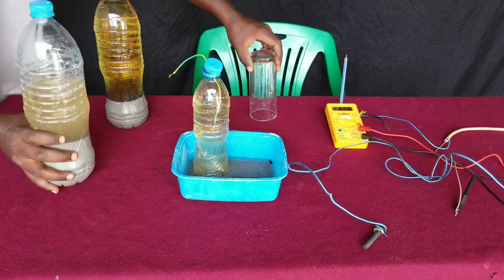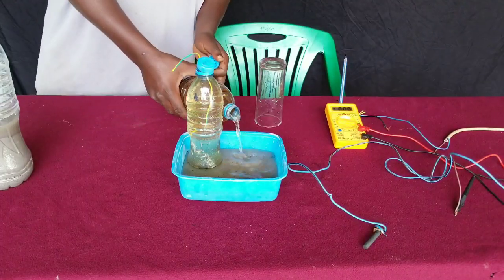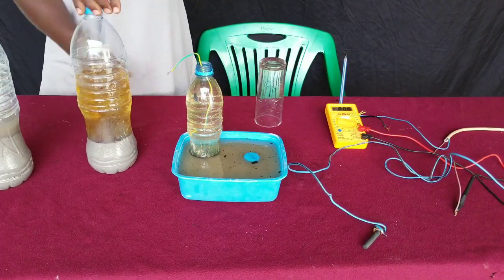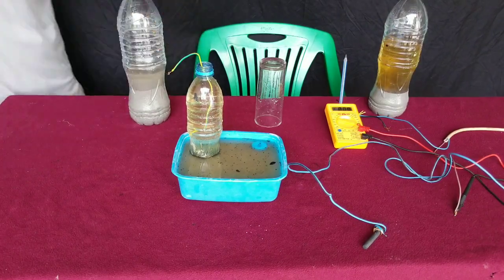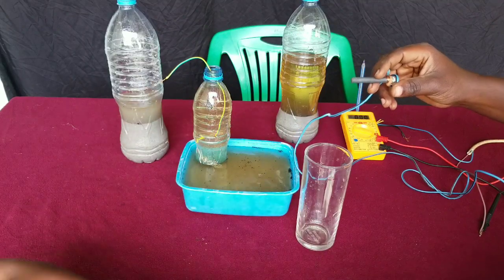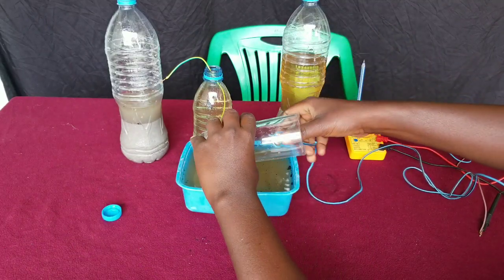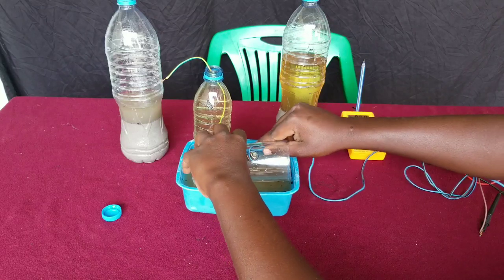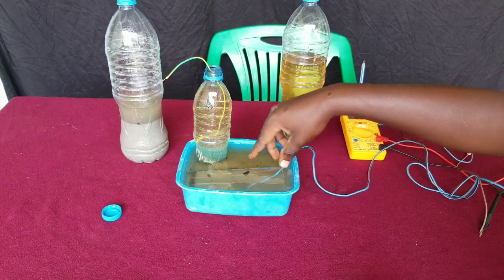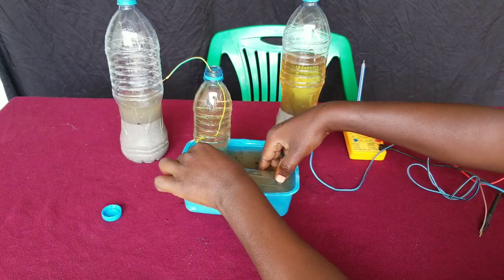We are also going to have a positive electrode where oxygen gas will be collected. Here we pour our potassium hydroxide solution to fill out our container, then we take our graphite electrode. This will be connected to the positive terminal of our solar panel, and the negative terminal of our solar panel will be connected at the place where we want to collect hydrogen gas.